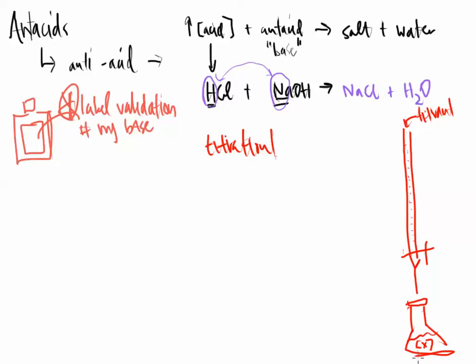This titration is a little bit more complicated because this titration is going to be called a back titration. So we're going to have to talk about this process of back titration. What is that really? What does that mean? And why do we do it? So that's going to be part of this whole pre-lecture video series.